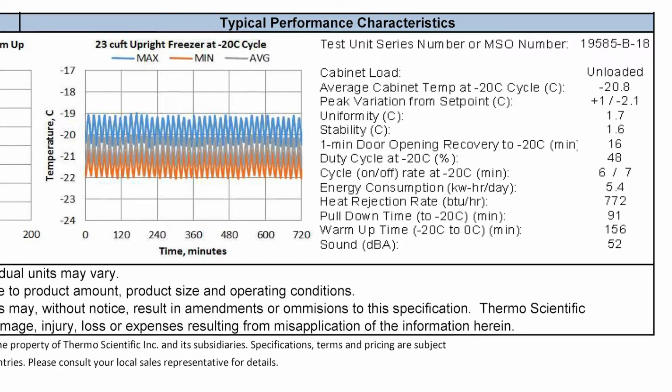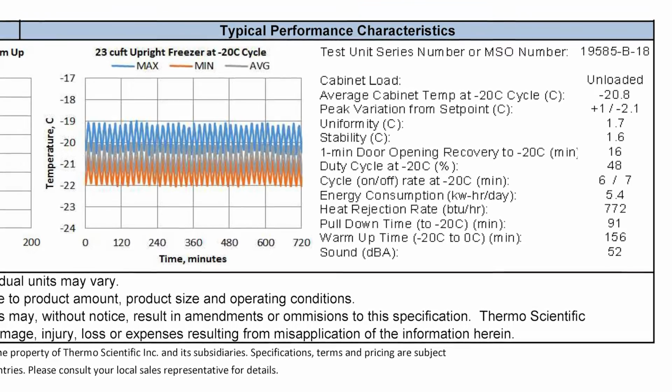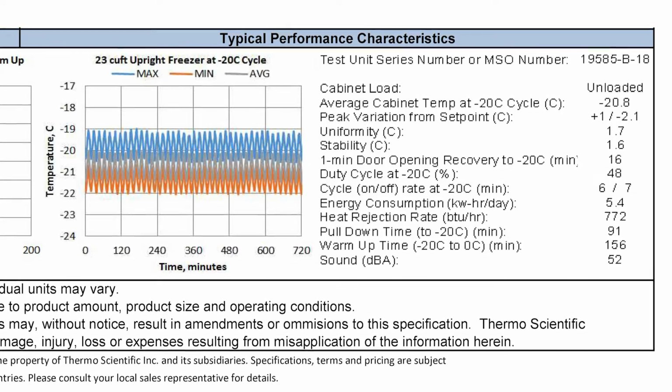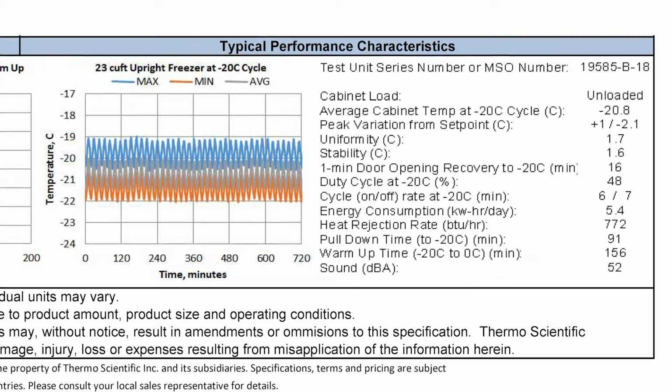These results are accumulated using a test protocol written by our factory experts to help ensure that the unit is functioning as designed. These test results provide a benchmark or standard for normal operation and represent how the unit operates under certain test conditions. Please be aware that these results are not intended to determine qualification test criteria or temperature test acceptance limits for your application. You, as the sample expert, are responsible for choosing the test protocol and acceptance test criteria that fits your application best. Be sure to keep sample safety and practical storage practices in mind.